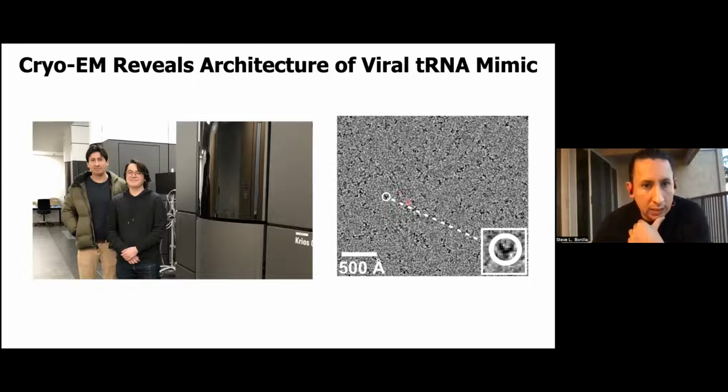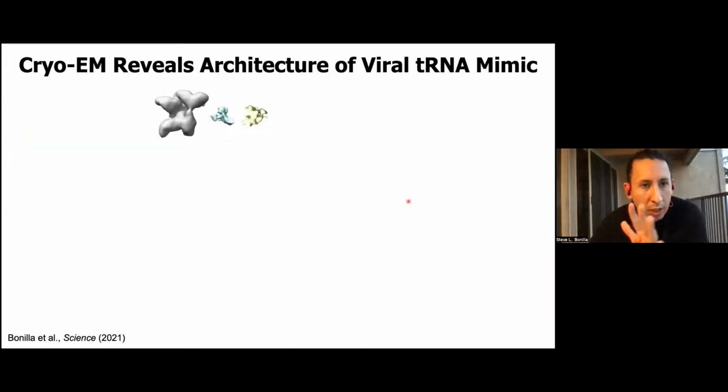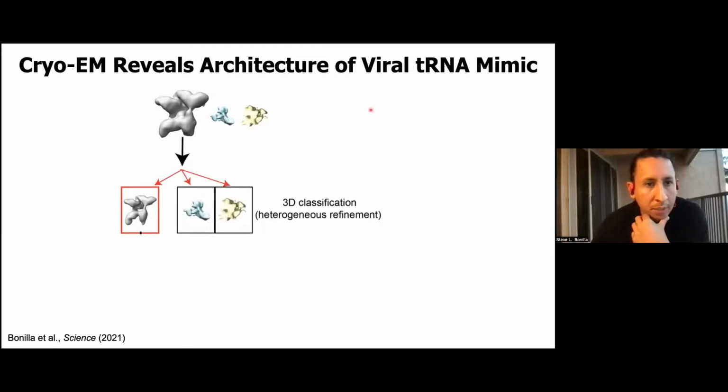All right, so at this point, I would like to discuss a little bit of the process that we followed to get a map of this RNA. Something that we found very useful in the process was to follow this little protocol. After a very limited 2D classification, so at this point we still have a lot of the particles in our sample, we generated ab initio reconstructions, and consistently only one of these ab initio reconstructions displayed features that resembled RNA secondary structure, which is helical features.